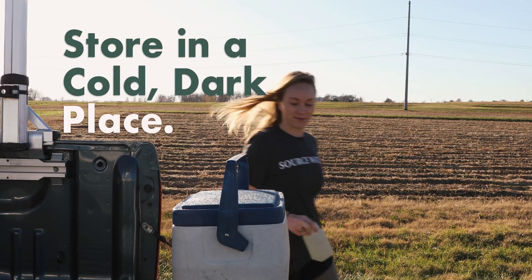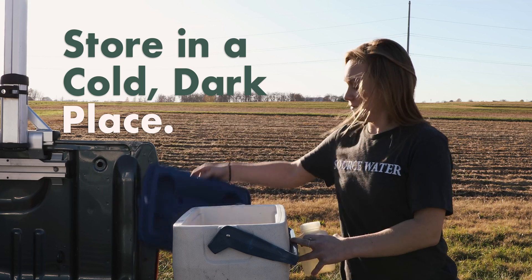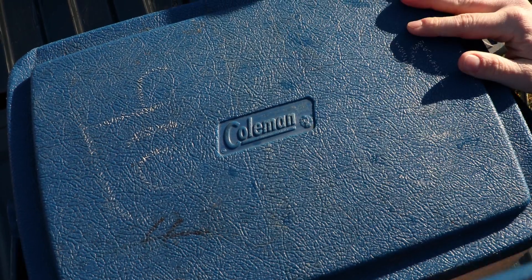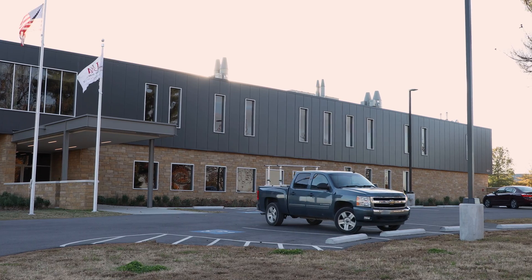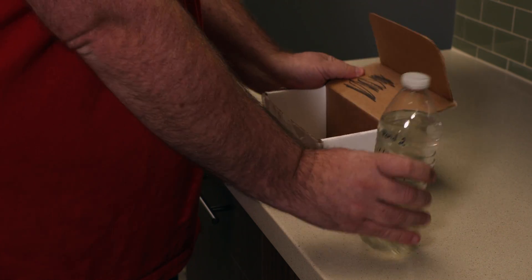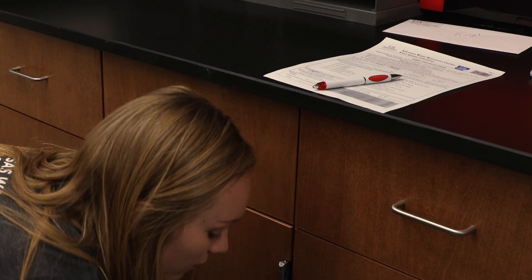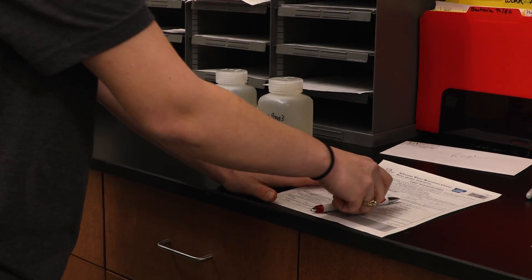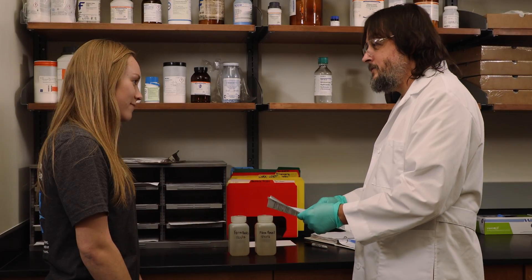For the best results, store your water samples in a cold, dark place like an ice chest. While in storage, the composition of water samples can change as chemical and biological reactions occur, so it is important to deliver your sample to the lab as soon as possible. If you need to ship your sample to the lab, try to overnight the package. Be sure to complete and submit a water sample submission form that matches your labeled sample bottles and include a check for payment.